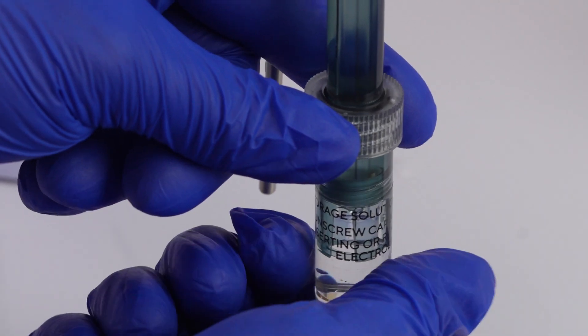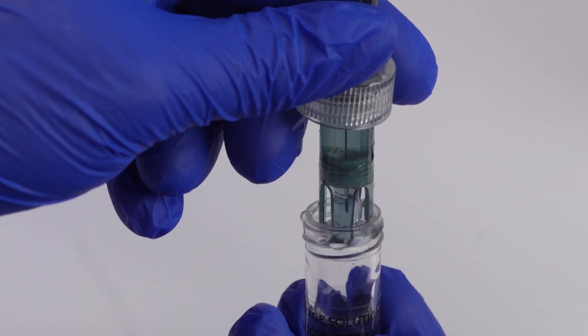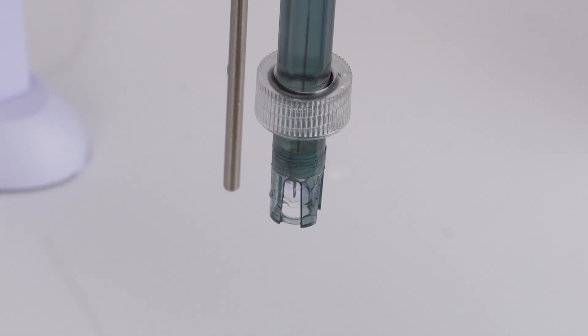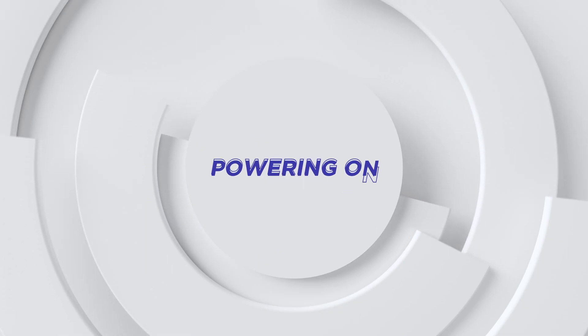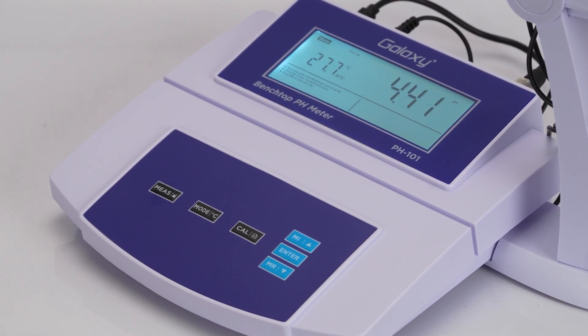Before use, remove the protective cap from the pH electrode. If you see air bubbles inside the glass membrane, gently shake the electrode downward to dislodge them. To power on the meter, press the measure key for about five seconds.